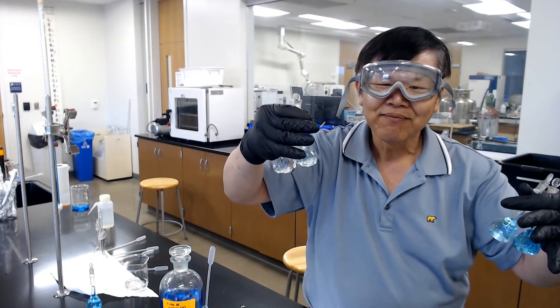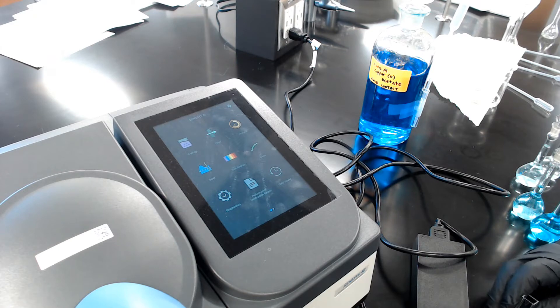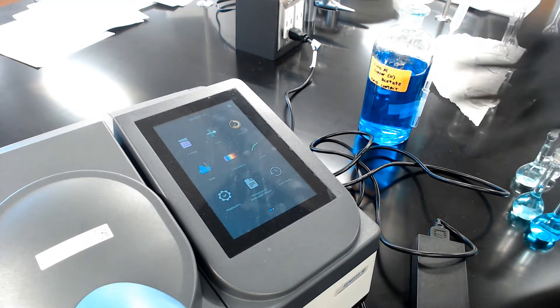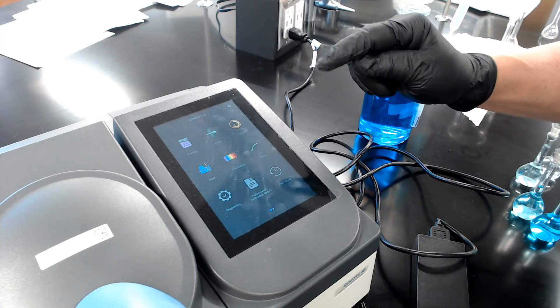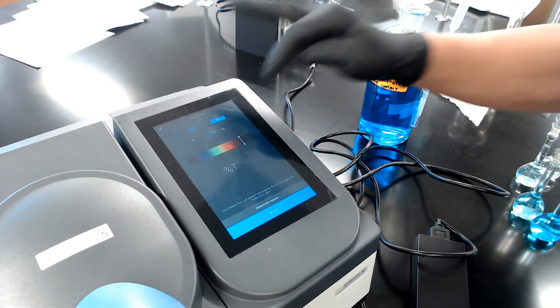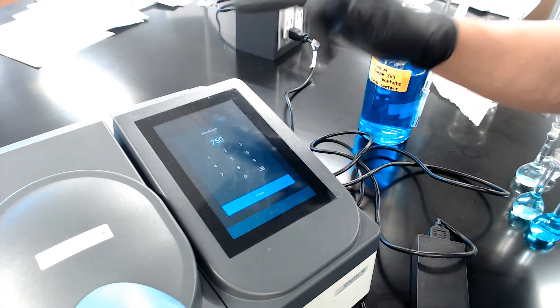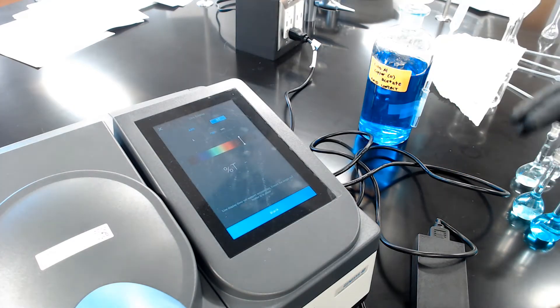Now that we've made the solutions, it's time to use the UV-Vis spectrometer to measure how much light passes through each sample. On the screen there are various options — select 'Live Display' in the middle. We've already warmed up the instrument for about 20 minutes. Push 'Live Display,' then push 'Percent Transmittance,' then type in the wavelength. Copper has an absorption peak maximum at about 750 nm, so type in 750 and press enter.